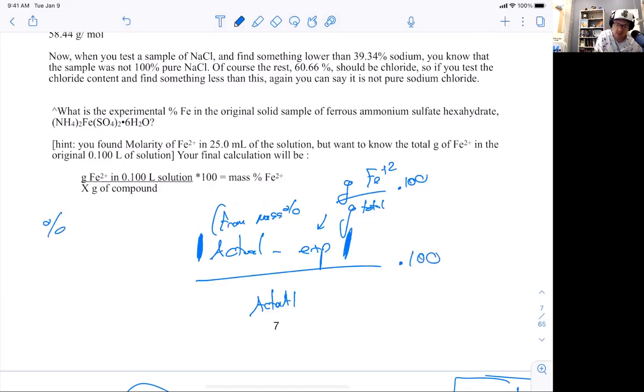And for percent error, especially if this is your first lab in person, less than 5%. Actually, this experiment doesn't say anything about you. It's talking about the purity of the compound. So percent error less than 5% error, that's pretty pure.